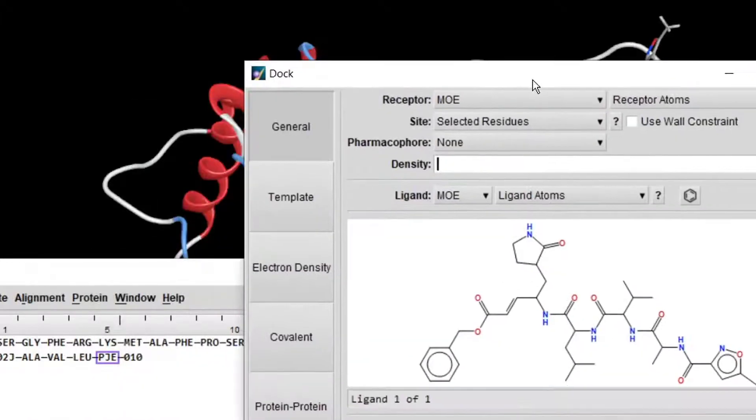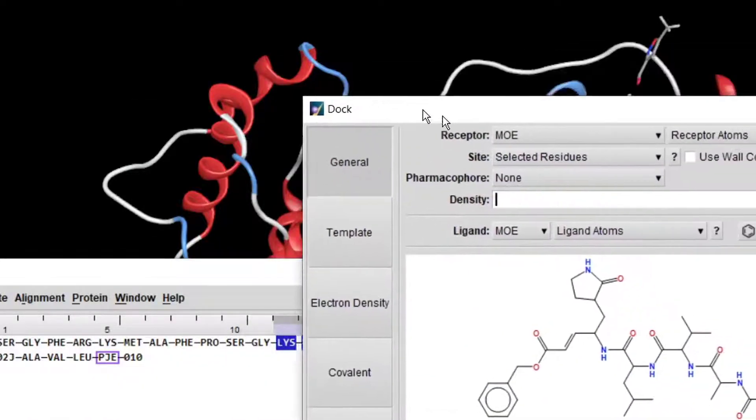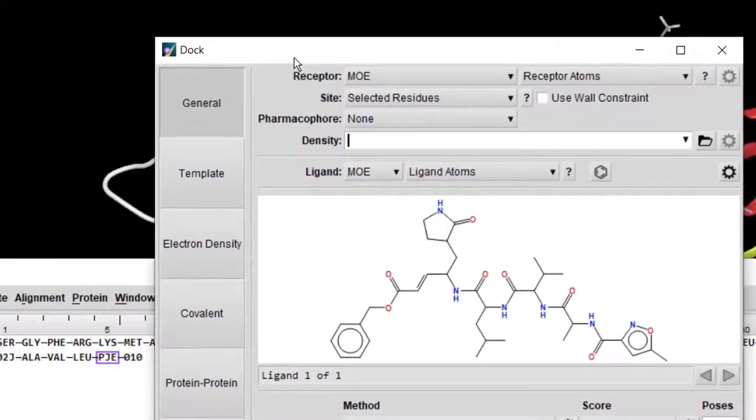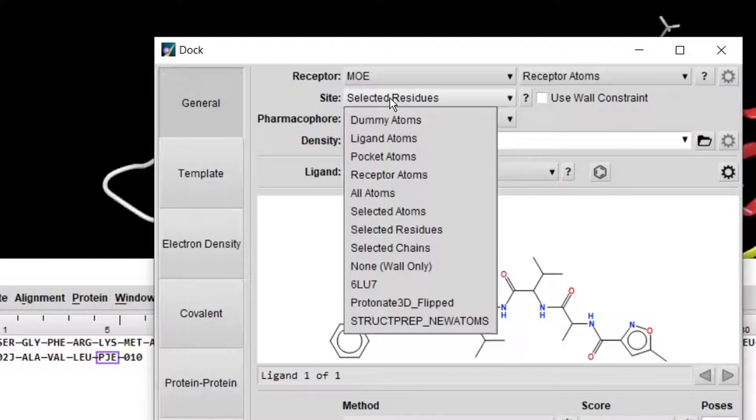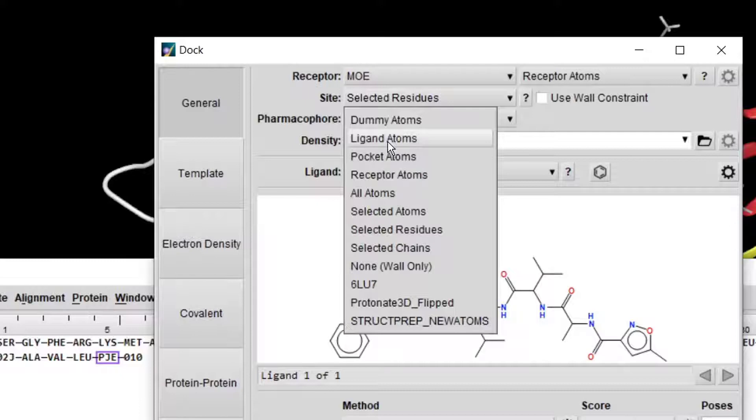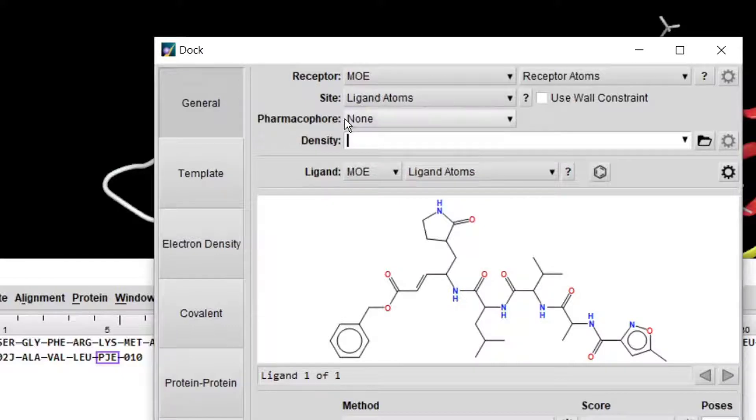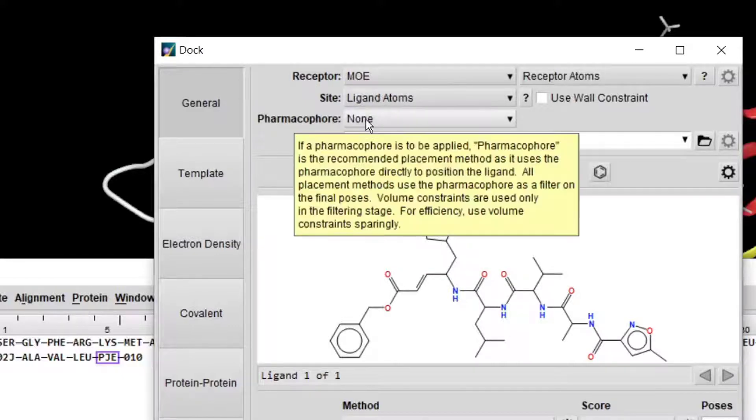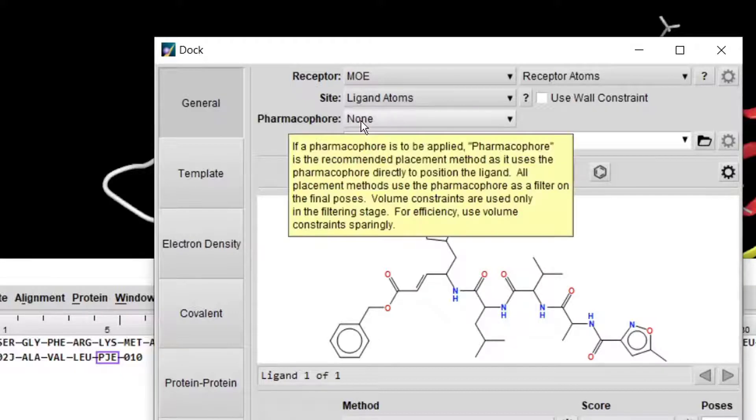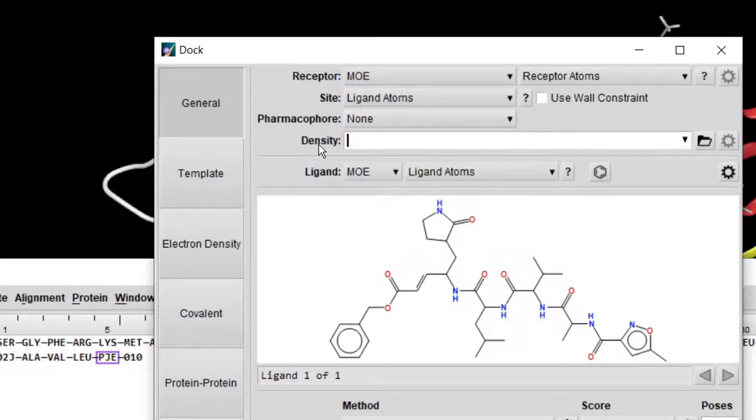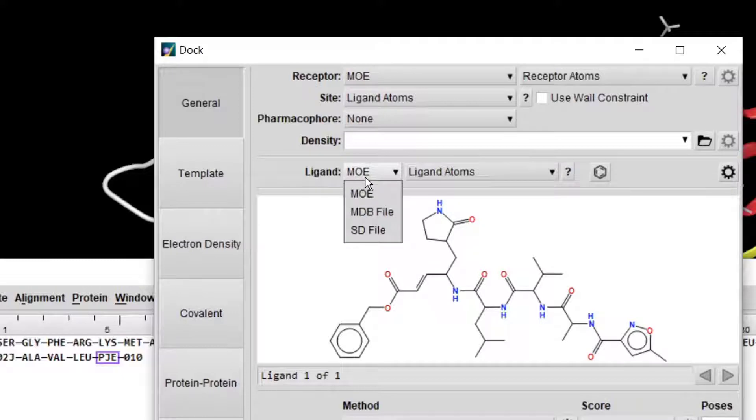Then go back to the Dock window and change it to Selected Residues. MOE will dock your ligand near the active site residues. But in this case, we already have the ligand in the structure, so I will tell MOE to dock my ligand into the active pocket where the protein-ligand is present. I will change it to Ligand. I don't have any pharmacophore - I will explain this in coming lectures.